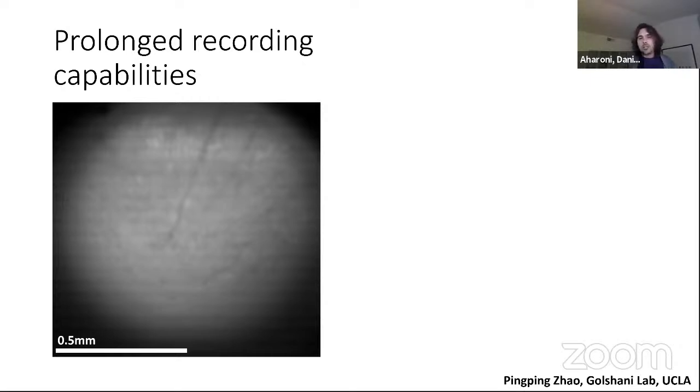And so at the end, I'll show a slide on it if I don't have it here. We basically finished the design, and we're in the final process of validating it in a couple different combinations of fluorophores and freely behaving mice.